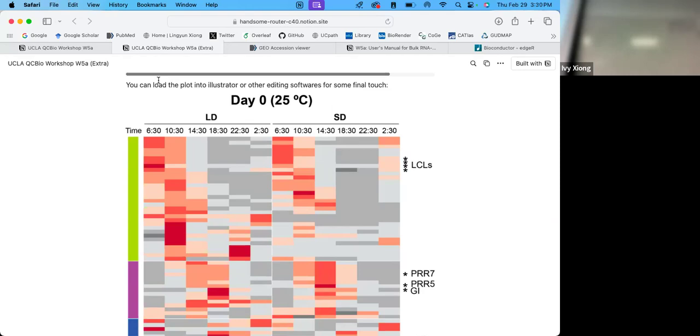So you have to do this in the terminal instead. I did that too. Maybe I have to go to... I'm on Hoffman right now. Oh, it's a local terminal. Yeah, you don't need Hoffman.